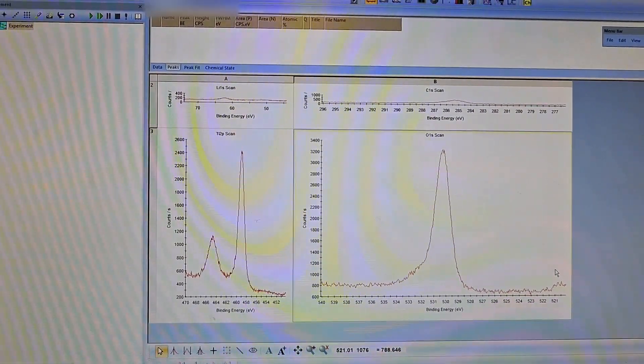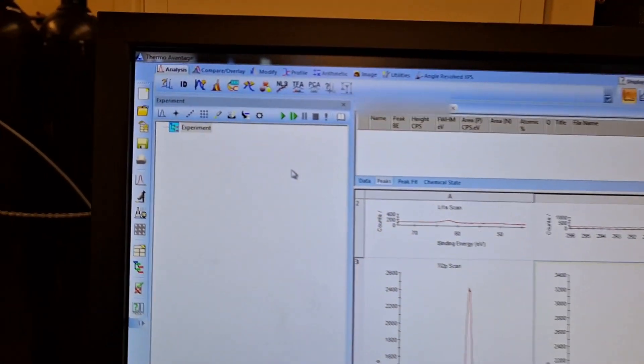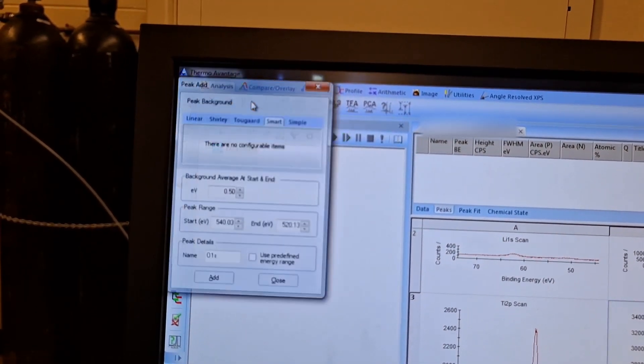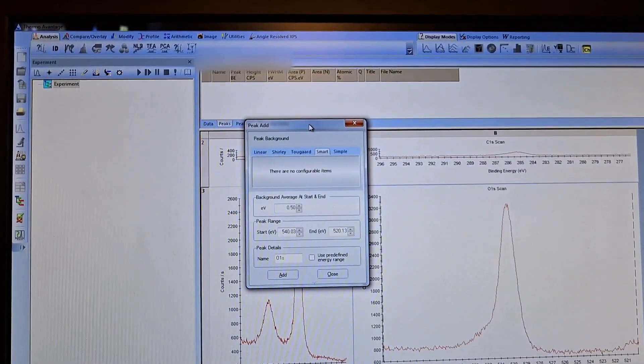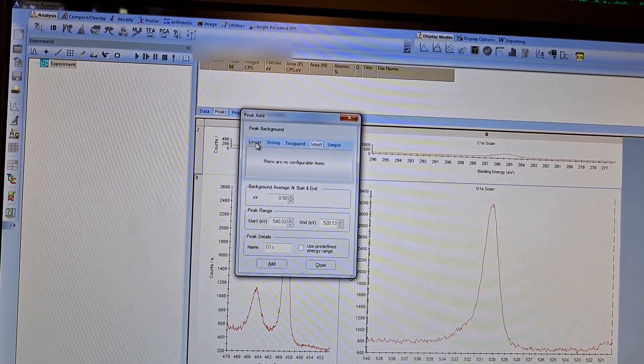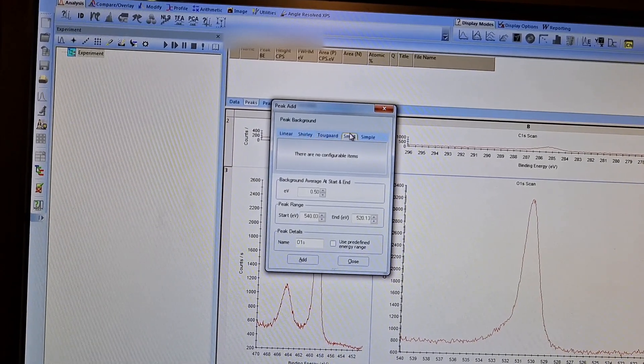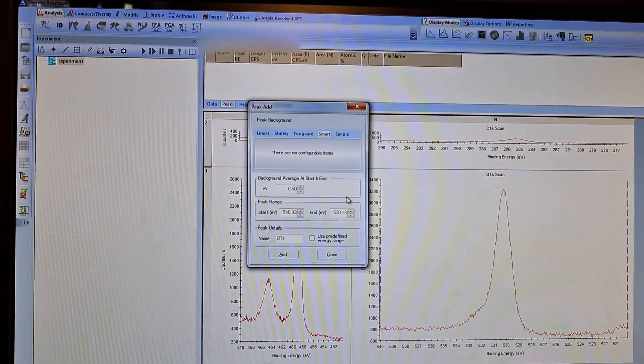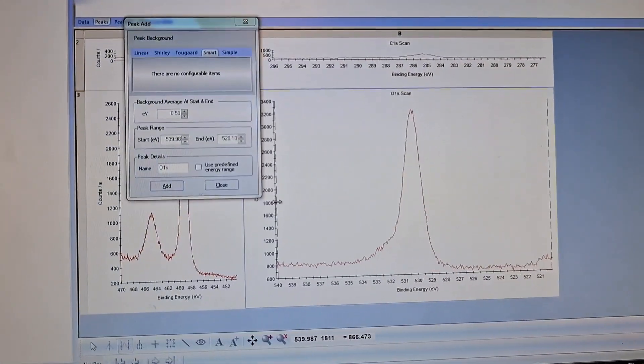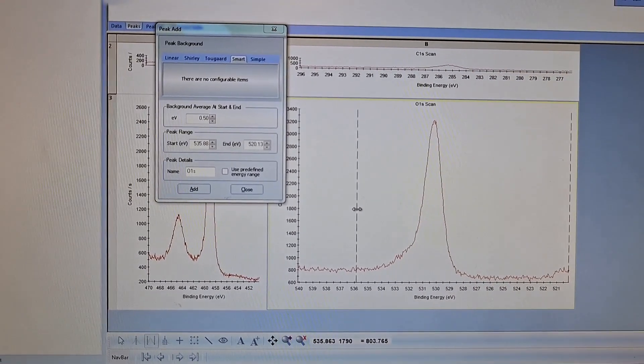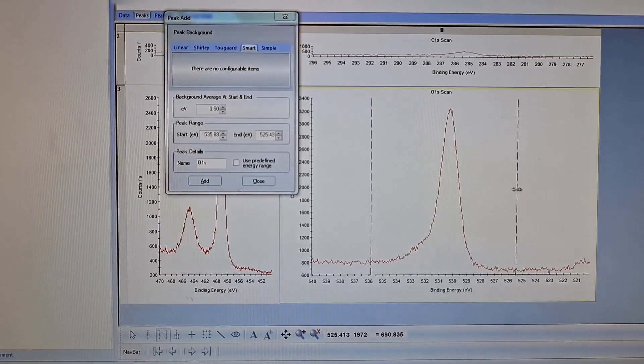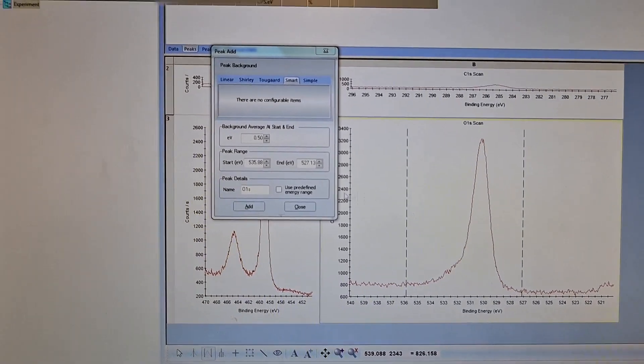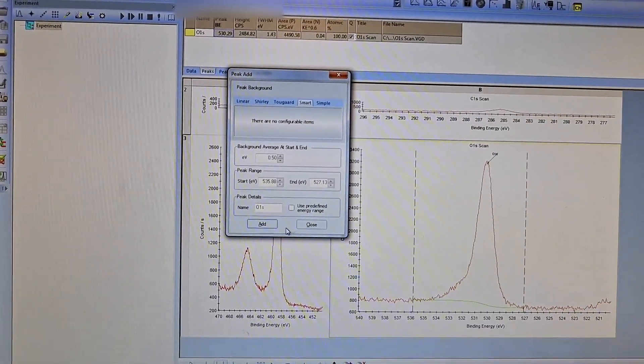Okay, I could make it bigger and I have that background. So I will click this icon. A window opens and I can select the background type: linear, Shirley, Tougaard, smart, and simple. I will select smart and I can change the positions. This place is good enough.